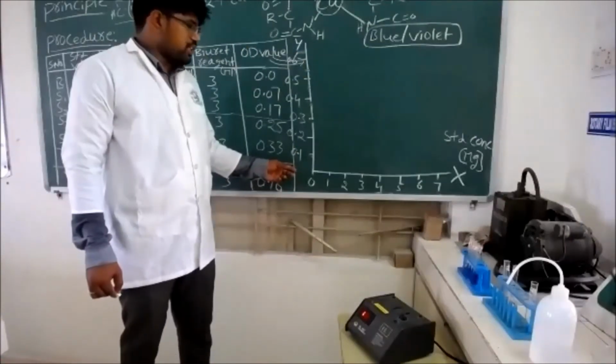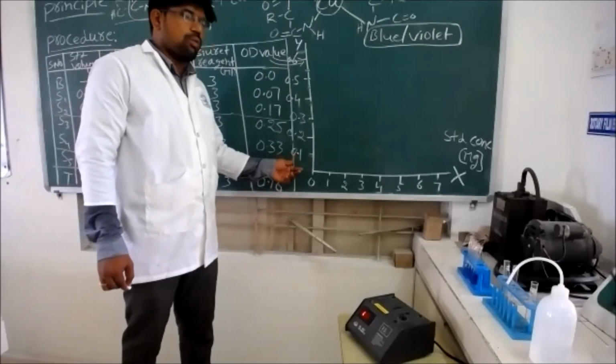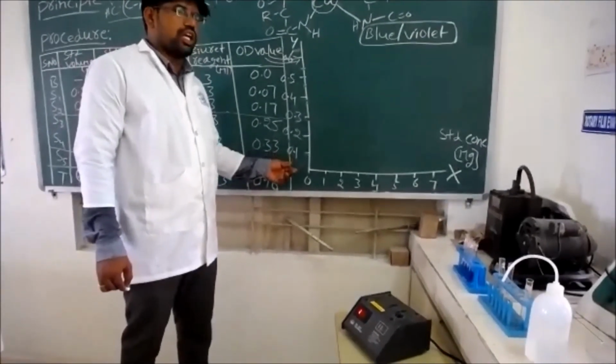So on the y-axis we are taking 1 centimeter is equal to 0.1.